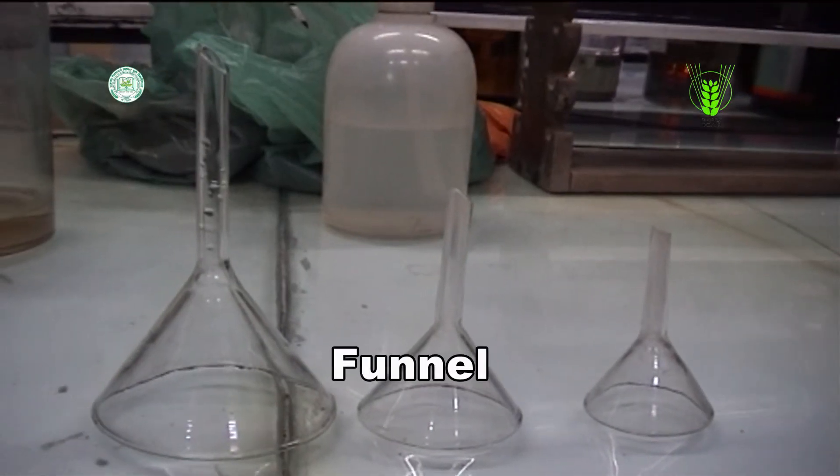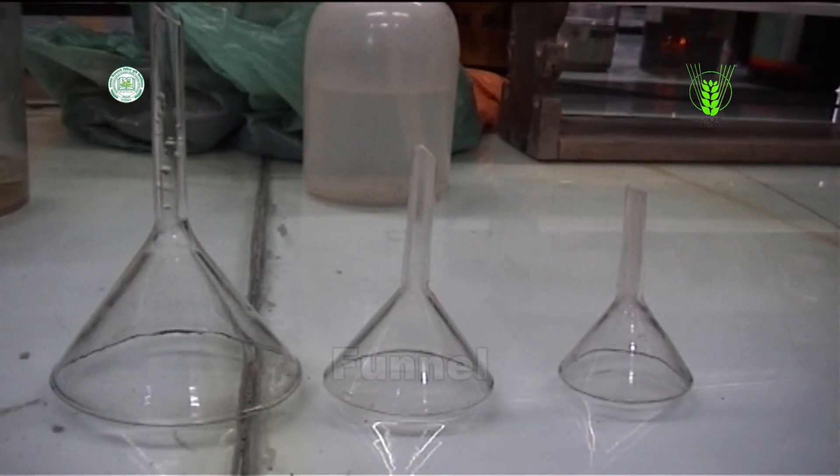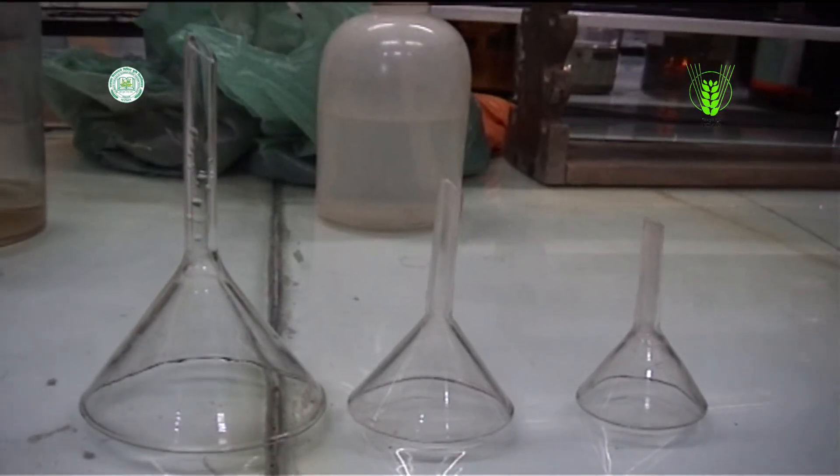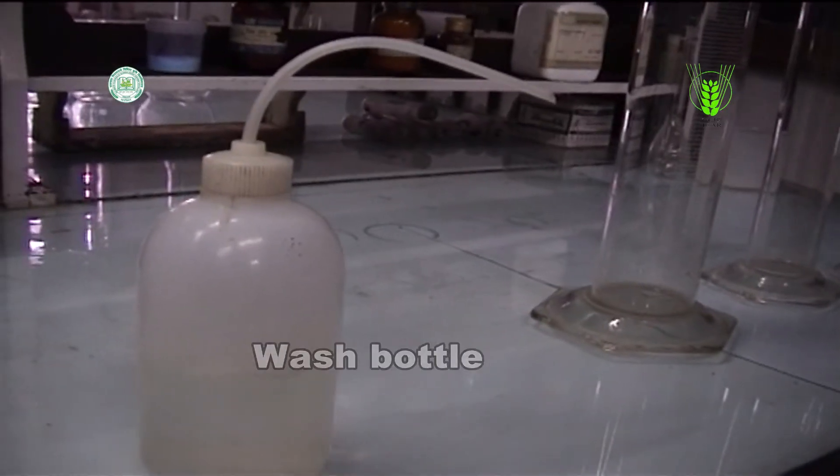Funnels. These are funnels that have been made for use in the chemical laboratory. Wash bottle.